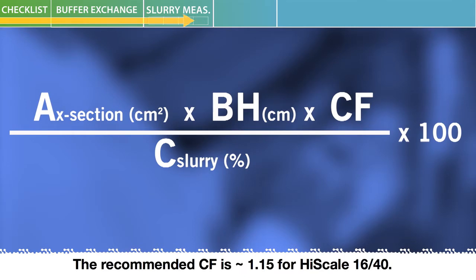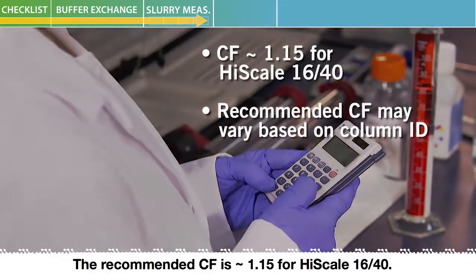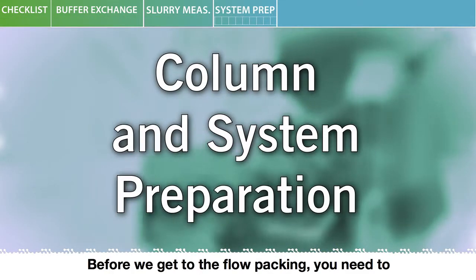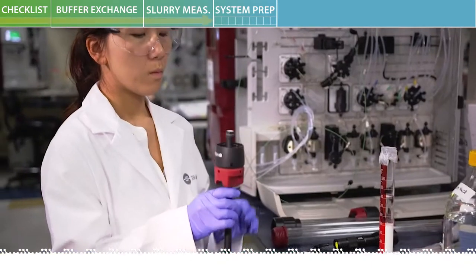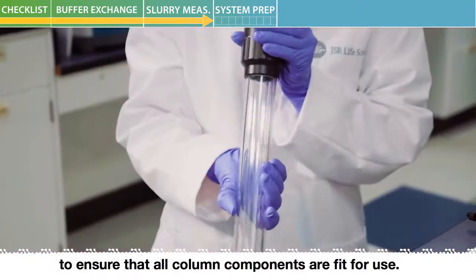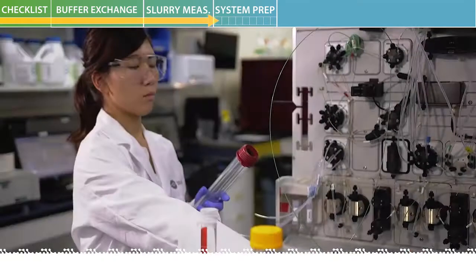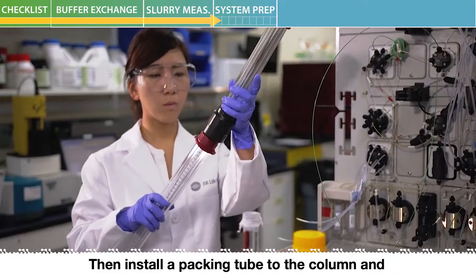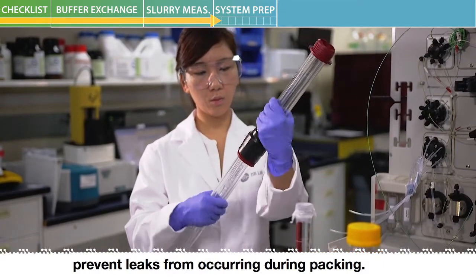Before we get to the flow packing, you need to check to make sure that everything in your system is ready to go. Perform a pre-activity inspection to ensure that all column components are fit for use. Then install a packing tube to the column and make sure the tube is securely fastened to prevent leaks from occurring during packing.